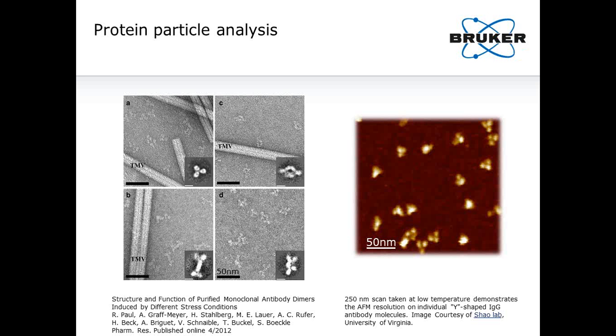They use TEM for their study, and again the computational methods to analyze the images, reconstruct high-quality representations of the complex species, and assign individual particles to these species for statistics are well developed for TEM applications. On the right we see monoclonal antibodies imaged by AFM at cryo conditions for optimal resolution. It can be seen that many of the antibodies imaged by AFM already show comparable quality to the average representations obtained with TEM. It seems likely that, given a similar attention to sample preparation, data analysis, etc., AFM would be a similarly useful tool for formulation development and quality control of protein solution-based drugs.